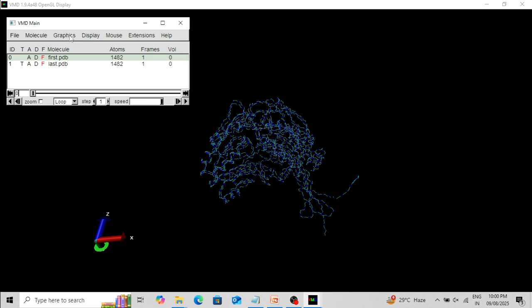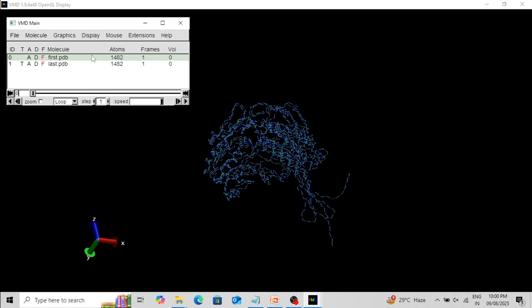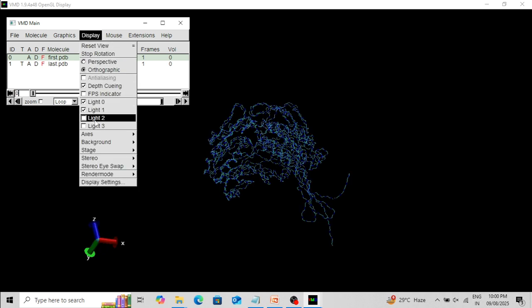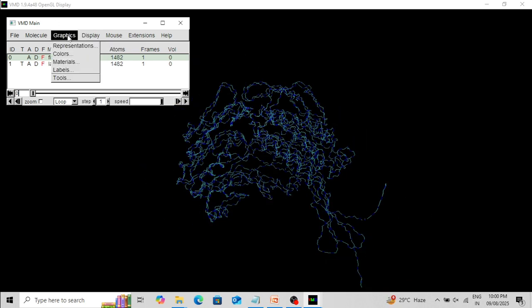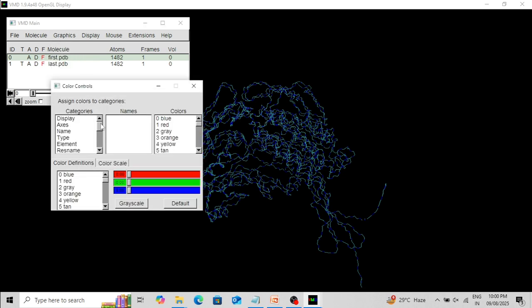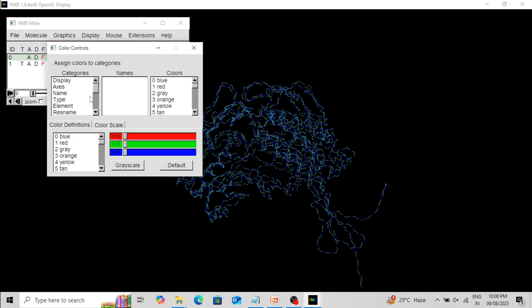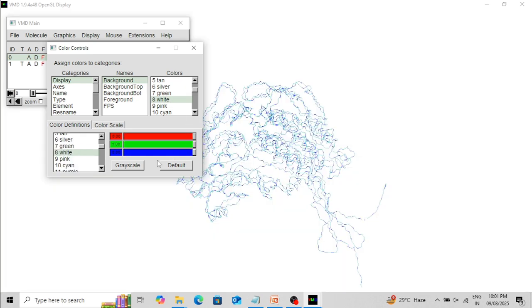You can change the view from Perspective to Orthography, remove the axis, and change the background from black to white.